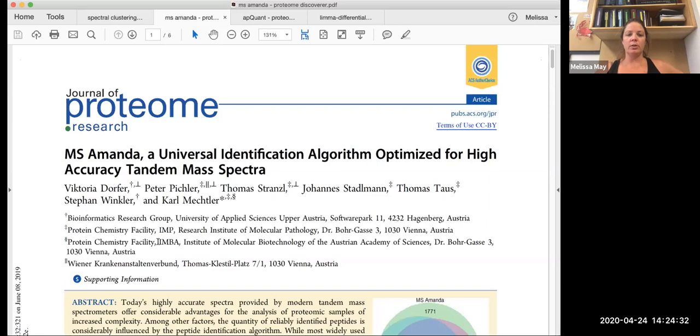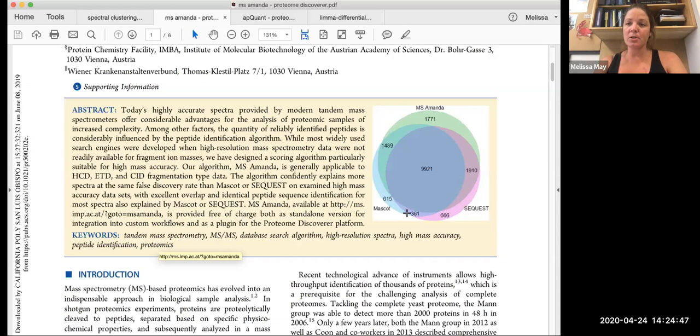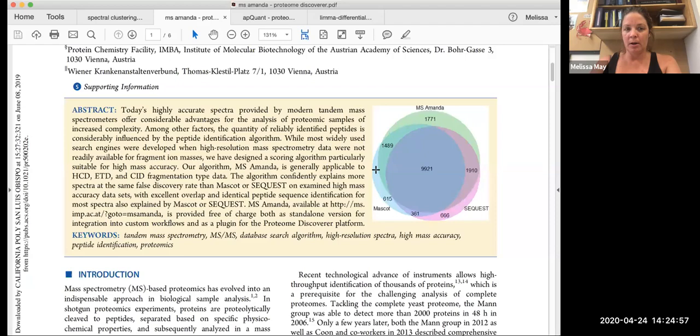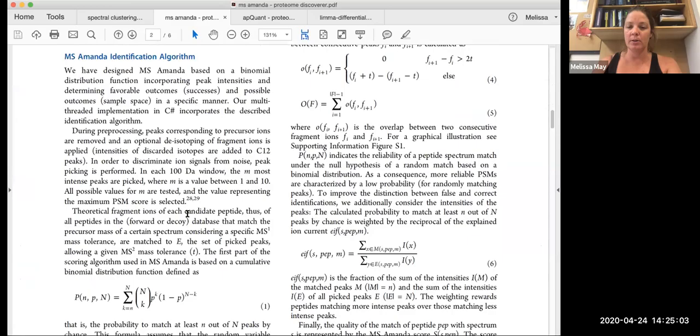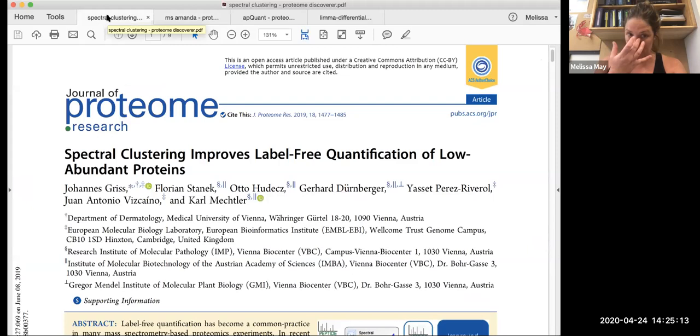So MS-AMANDA, which is one of the nodes that we use, is similar to MASCOT or SEQUEST. SEQUEST is the default peptide identification program that's used in Proteome Discoverer. And so this is a different algorithm that's used. And basically it just helps to improve the number of peptides that you are recovering. So if you're interested in reading more about their algorithm, they go through and discuss the different filters and statistics that they used to design this algorithm. The next node that we're going to use is through the same group.